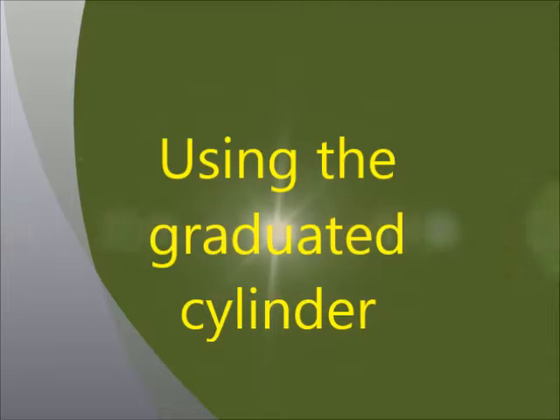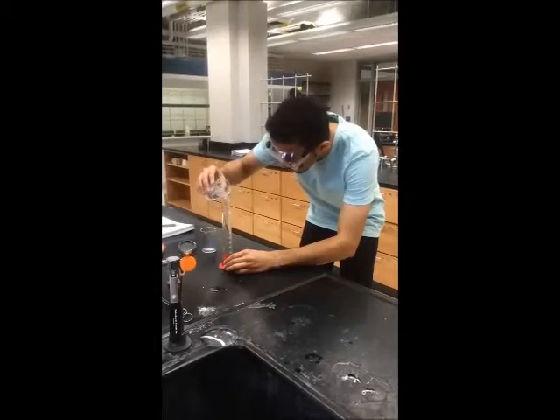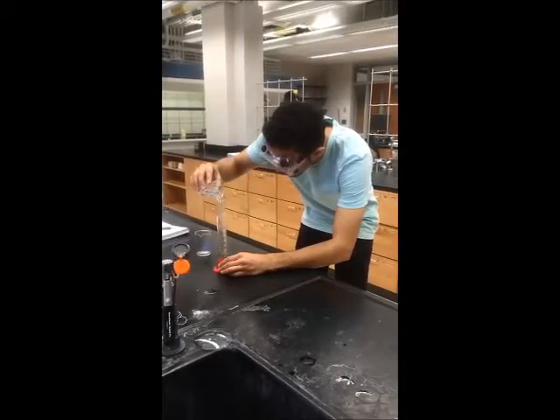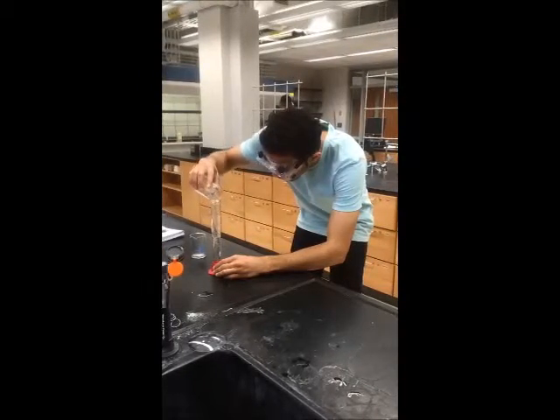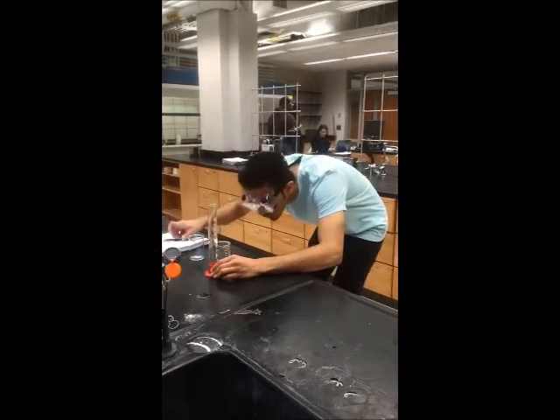The steps to find the total volume in a graduated cylinder are similar to the pipette. Pour some of your solution in the graduated cylinder. Like you did for the pipette, you want to read at the meniscus and record to 1 degree of uncertainty. This will be your initial volume.